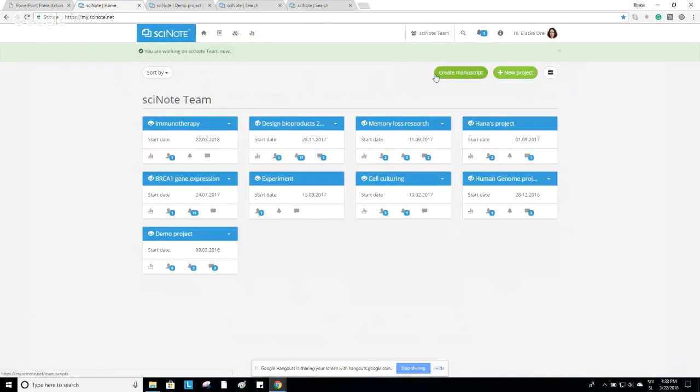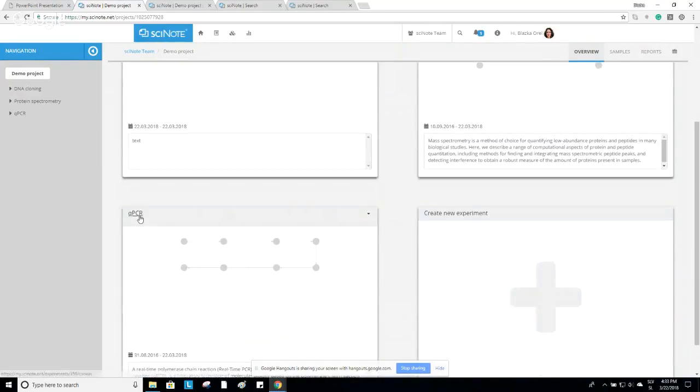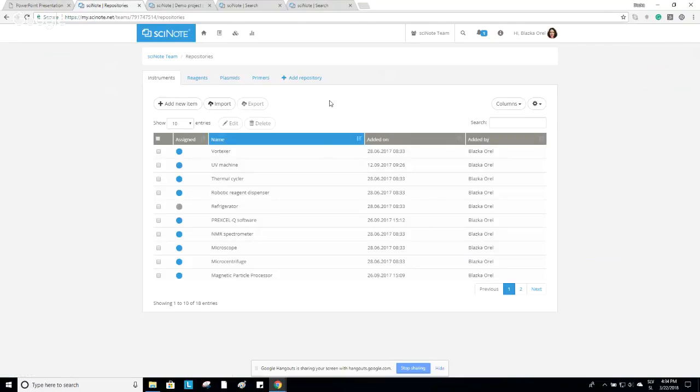Just to see the question once more, so that I understand it correctly. These instruments that you're asking about, Igor, if they're predefined. Basically, these instruments can be part of your custom repositories. And the custom repositories are accessible, if you're following my mouse here, at the top menu bar. So they're not predefined. You can actually rename these repositories.